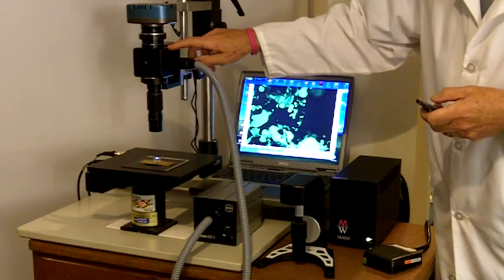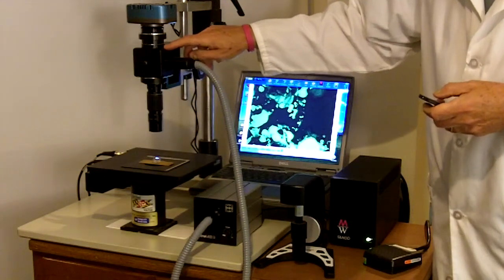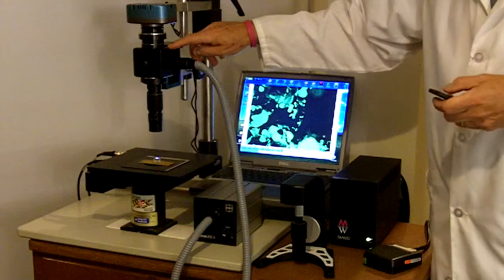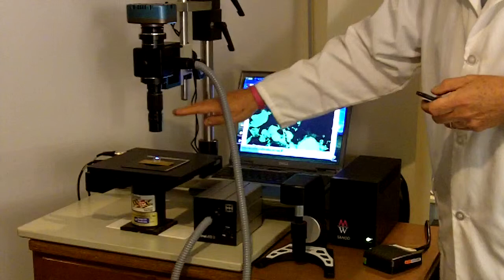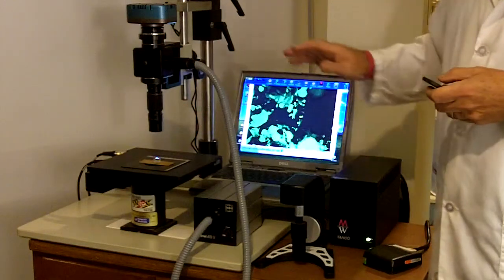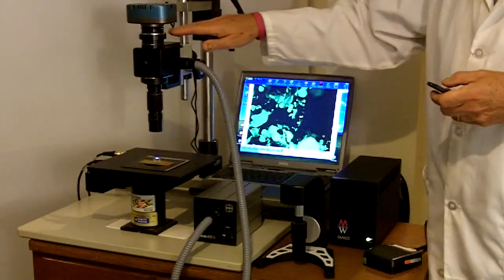The filter cube housing using oversized filter cubes made by Chroma USA. This entire system from here on down is made in America and it's designed so that you can attach C-mount cameras.